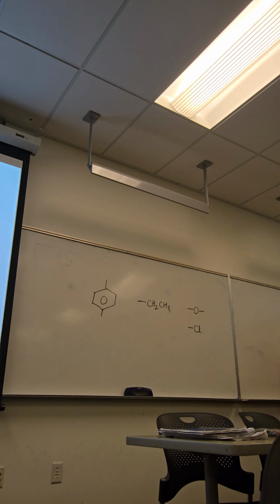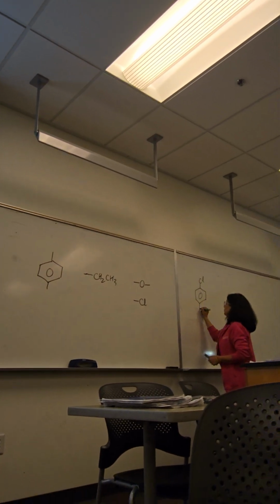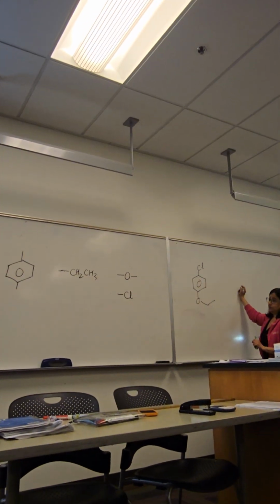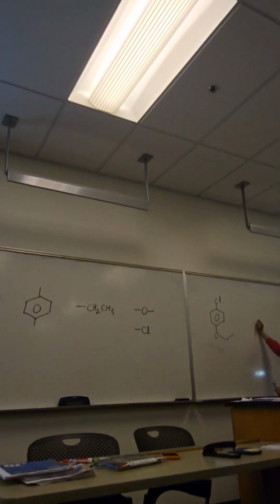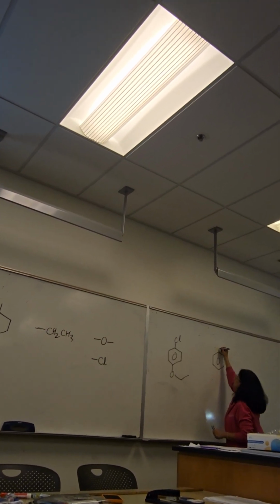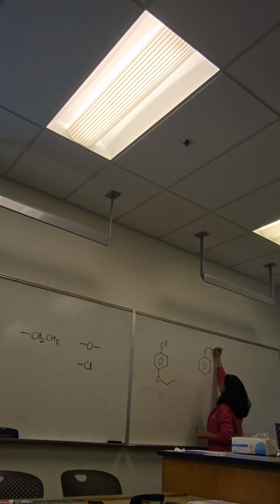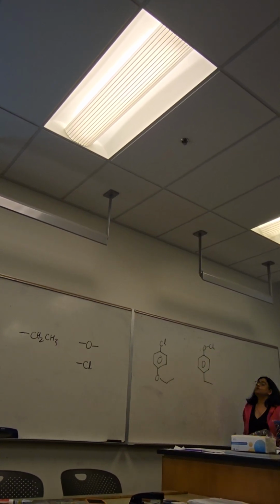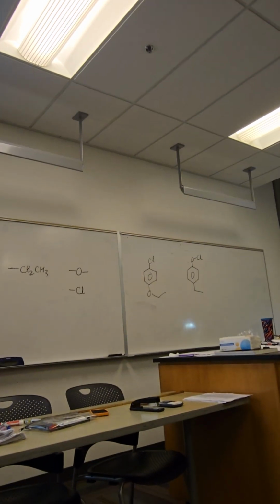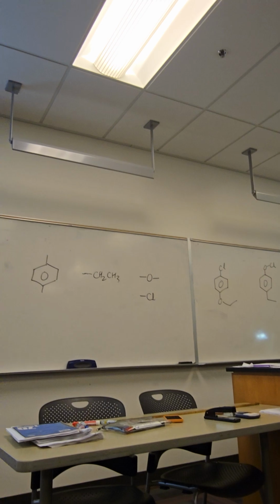Do you agree that I can put these pieces together in two different ways? One is put CL, put O, SO. Yeah. But that's not matching the spectrum, which makes more sense to me, but it's not matching the spectrum. So the other possibility is... exactly, that's why I'm baffled. I think my formula is wrong. When I figured it out, I think I made some mistake in there. But those are the two possible ways, though.